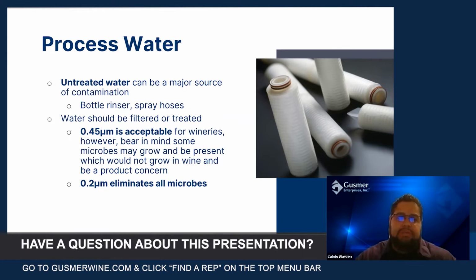In some other markets, 0.45 might not be good enough, but for wine micro, it's good enough. But some folks will go all the way down to 0.2 micron, and that will eliminate all microbes.